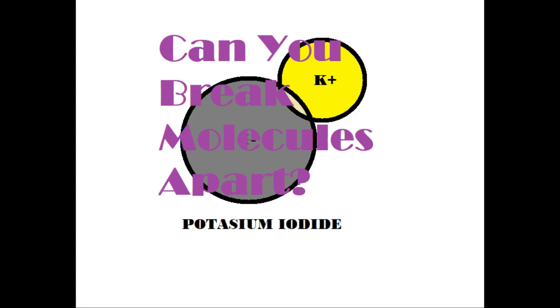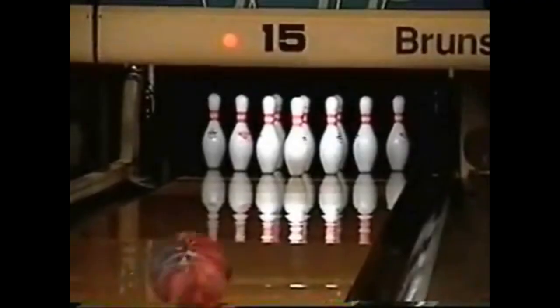Can you break molecules apart? Well, you know what the old saying is, you can scatter molecules like scattering bowling pins. Well, okay, I'm not sure that might be the old saying. Yeah, I think we just kind of came up with that. We can make it an old saying. Let's make it an old saying.